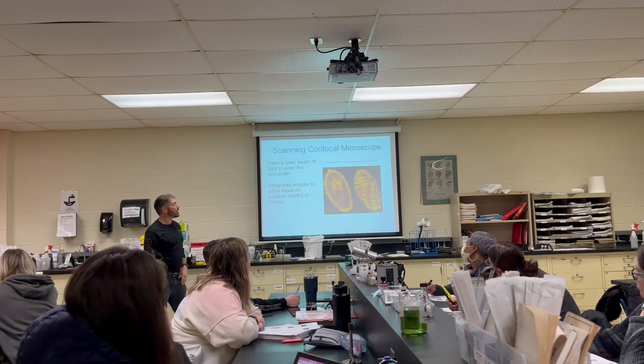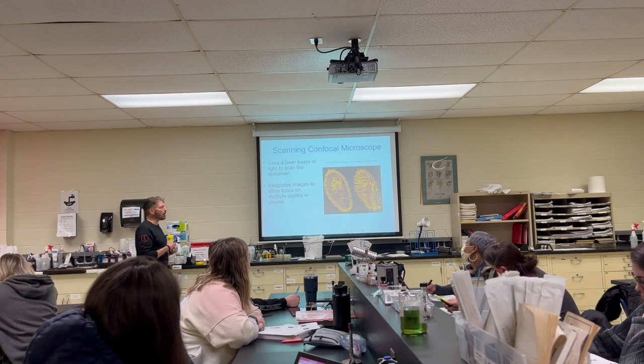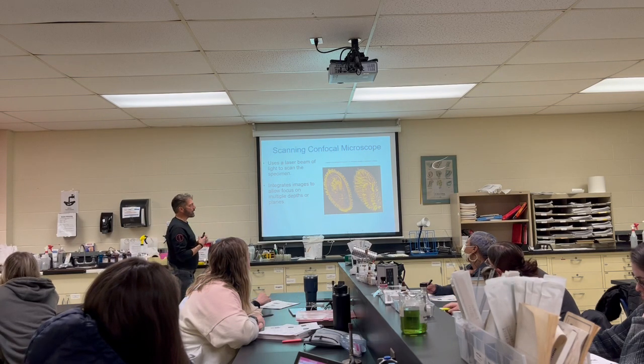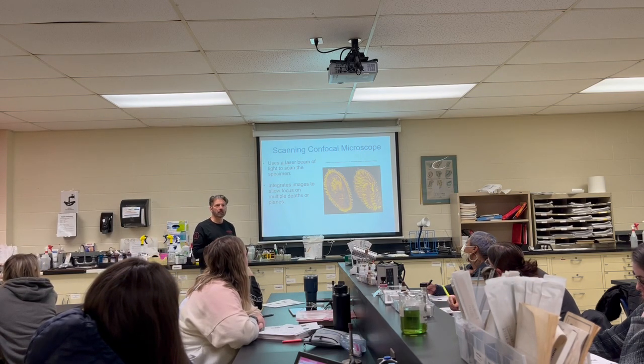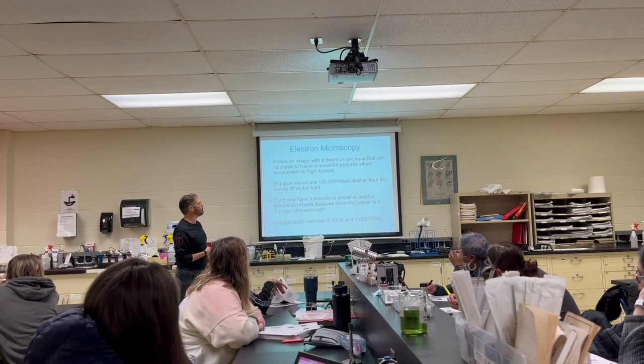And there's a scanning confocal microscope. This kind of bounces off the object, sort of like, do you guys know how sonar works? It bounces things off to get an idea, similar to that.